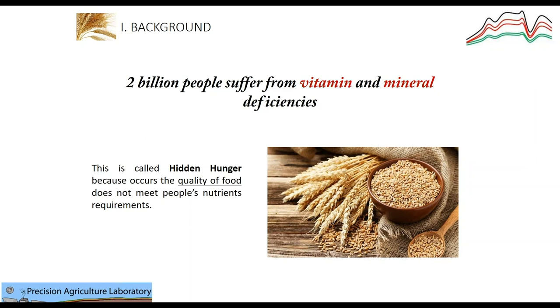So this is one of the latest things that we're doing. This is made by Dr. Vanessa Pino. She's Chilean as well. She's working as a postdoc in the Sydney Institute of Agriculture, and she's using XRF to assess the amount of heavy metals or of nutrients that we need in our nutrition. So it's the same concept.